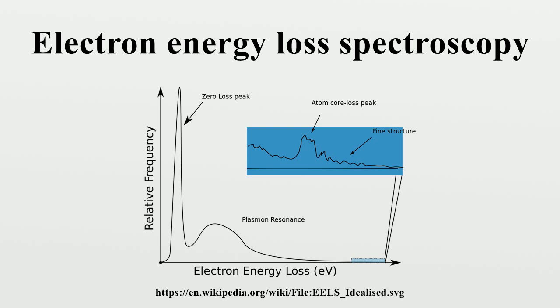Variants. There are several basic flavors of EELS, primarily classified by the geometry and by the kinetic energy of the incident electrons. Probably the most common today is transmission EELS, in which the kinetic energies are typically 100 to 300 keV and the incident electrons pass entirely through the material sample. Usually this occurs in a transmission electron microscope, although some dedicated systems exist which enable extreme resolution in terms of energy and momentum transfer at the expense of spatial resolution.